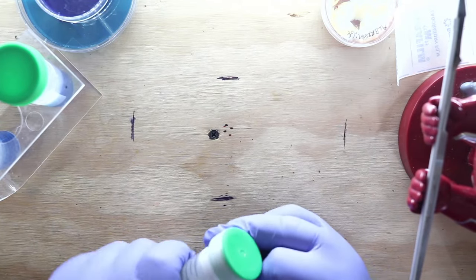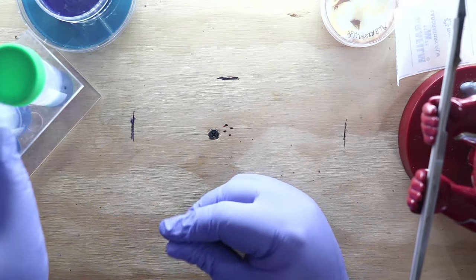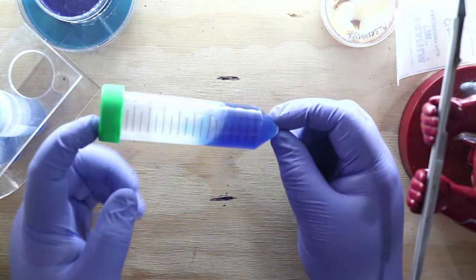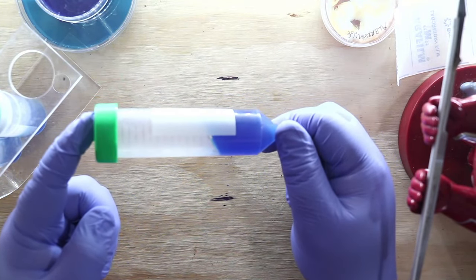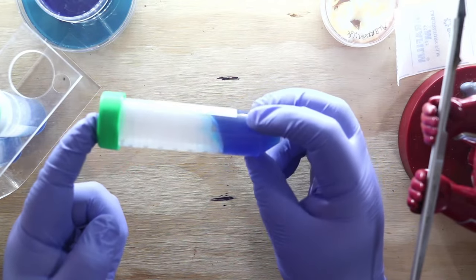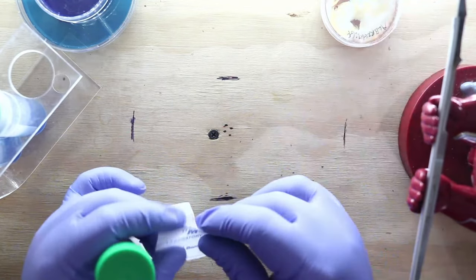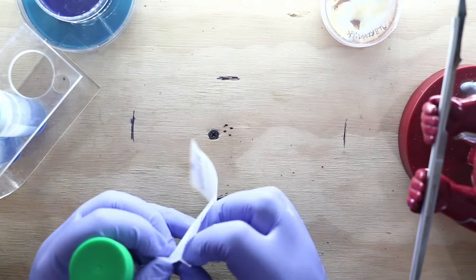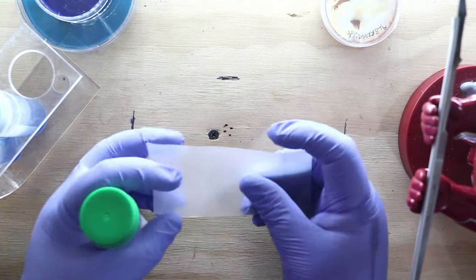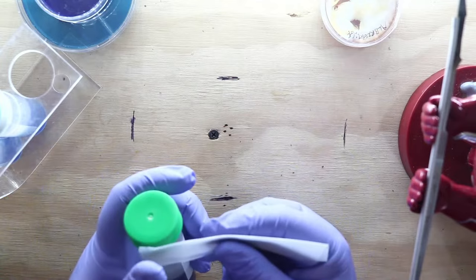What were you saying, Samantha? Someone asked if we put wood sticks in our slants. I don't. A lot of times I'll put sawdust in the bottom, but I have found that with these big, thick, chunky agar slants, you don't really need a stick in them. I've had slants that are 3 or 4 years old that still don't have all the food coloring consumed out of them, because we're keeping them cold stored. They're basically going into stasis.